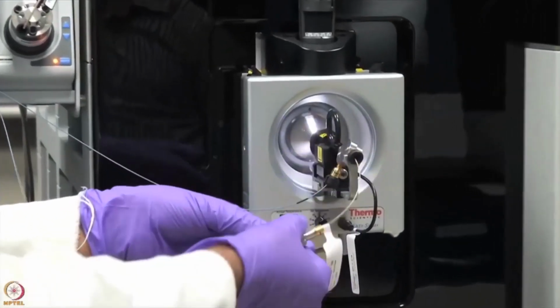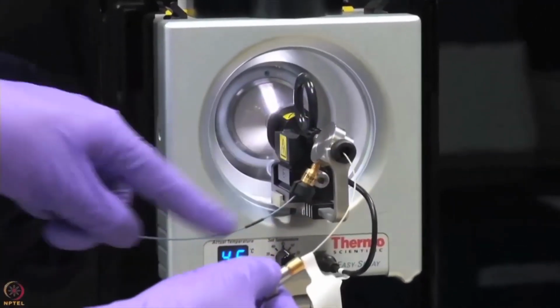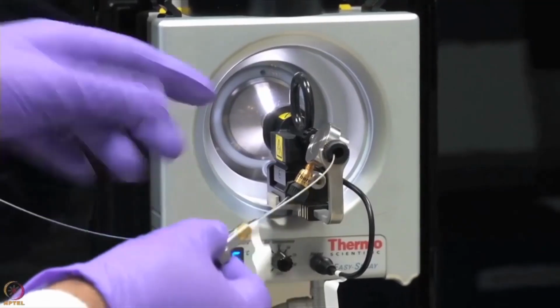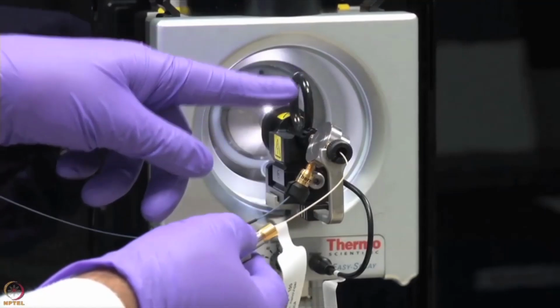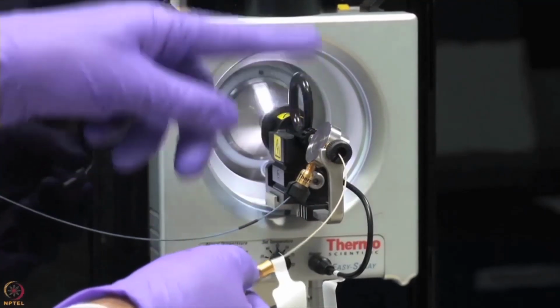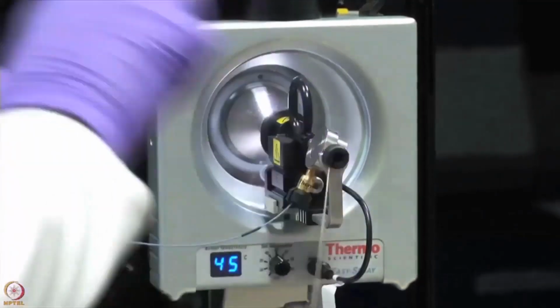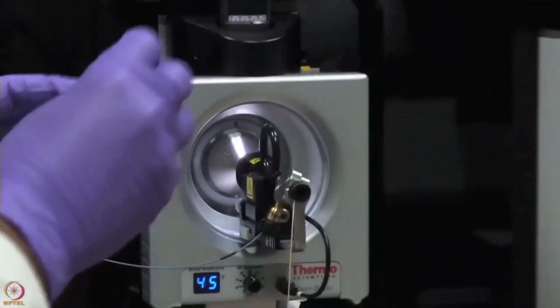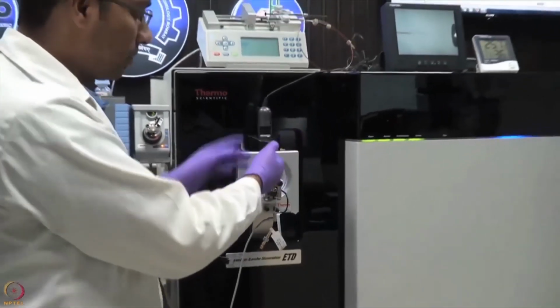Basically desalting, and your peptide will start to bind in this column, and then waste will go through this tube into a waste beaker. Now, once your sample has been cleaned in the pre column, then the second column, which is the analytical column, your sample will start to pass through, and they will start to fractionate, and slowly the first hydrophilic peptides will start to elute, and then hydrophobic peptides will start to come.